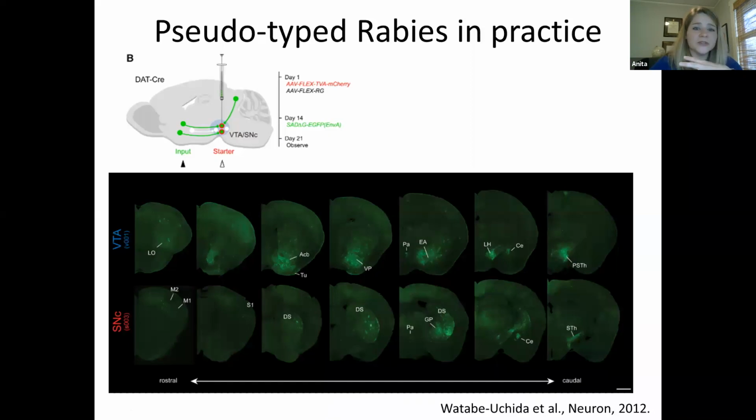I'm feeling very emotional because I had ordered the stupid self-inactivating rabies. It turned out there was a point mutation and it wasn't actually self-inactivating. So anyway, anytime you're ordering viruses, as I showed you, they're all being kept in cultures. So they're in cells when they're being made. So if the cells get any kind of contamination, that can propagate to your rabies. So anyway, there's supposedly self-inactivating rabies that should be long-lasting and stable.